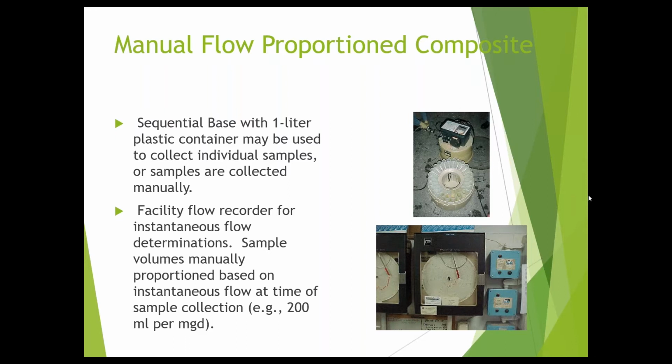So I can't recommend that when your sampler is done, you leave it sitting in there for a week. But based on what you're sampling for, talk to your laboratory. You might be able to leave it in there overnight if your sampler finishes at 2 a.m. and the first person doesn't get there until 9 a.m. That might be fine, but it's going to be based on what you're sampling.